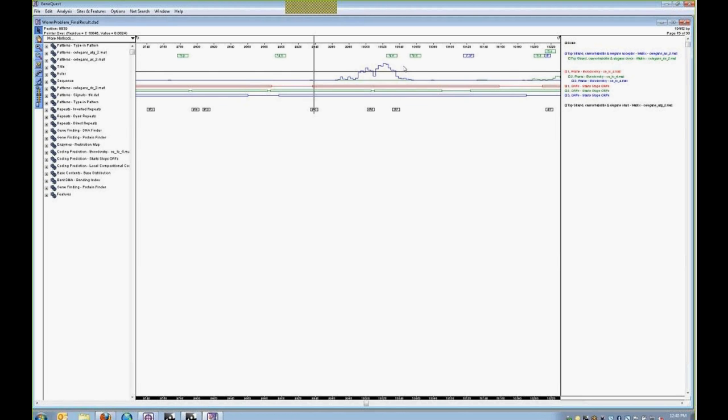From here, we need to identify if there's either a stop site, or if this is a multi-exon gene, we need to identify a donor site. So being that the open reading frame ends over here and our Borodovsky peak ends considerably earlier, and we do have 2 donor sites that we've located, it's most likely that this is just the beginning of exon 1 here.